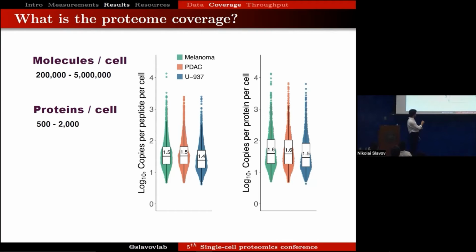And of course, this number of proteins per cell is a metric that the community has traditionally been very focused on and wants to increase, and that's a good thing. But we have to keep in mind that it's not the sole or the most important metric, because there are also all sorts of questions that we have to ask to put it in context. One is, what is the confidence in the number that is being reported? What are the copy numbers sampled per protein? What are the systematic artifacts and noise associated with those measurements? So in many ways, I think it's not the metric to emphasize in isolation of all the other ones. But that being said, it's clearly an important one.